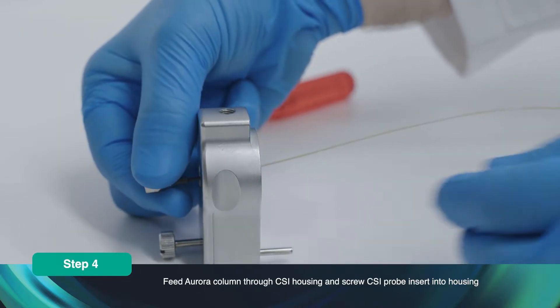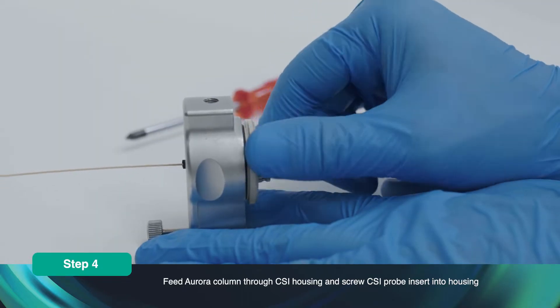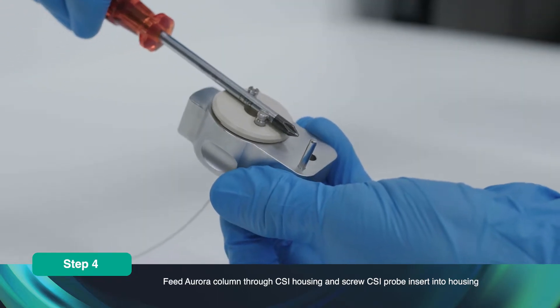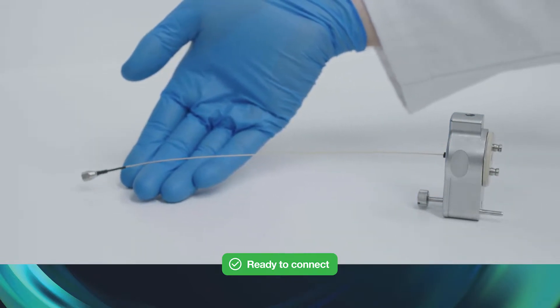Feed the Aurora column with Nano Zero fitting through the CSI housing. Screw the CSI probe insert into the housing. The CSI housing is now ready to connect to your LC-MS system.